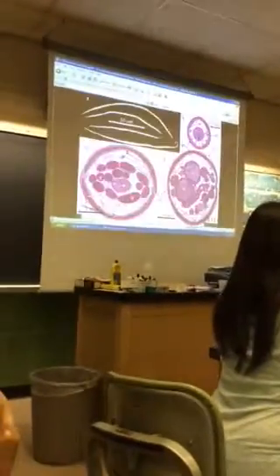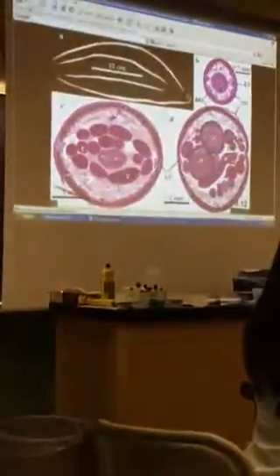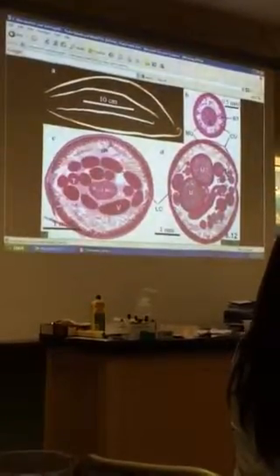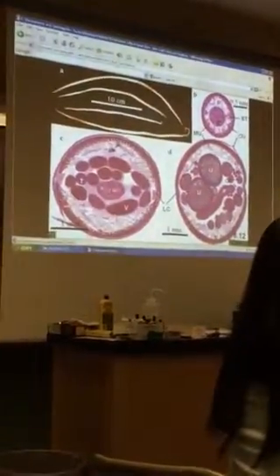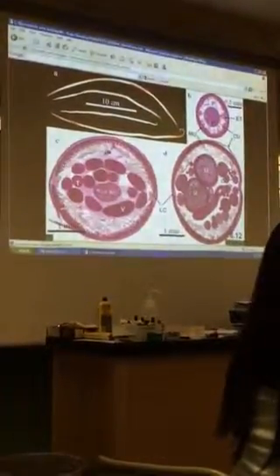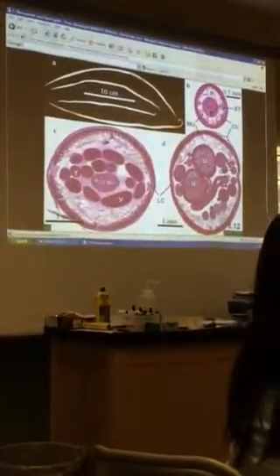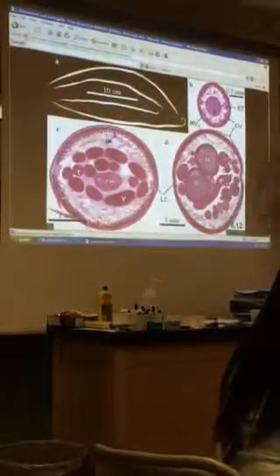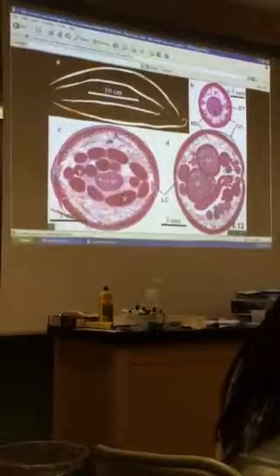Nice and big, and it just serves as a good example of general nematode biology. Not that everything is constant, but there are a lot of characteristics of the nematodes that we'll be talking about in class that we can see nicely here. So it'll help if you do the dissection first, because all that spaghetti in there, if we cut it crosswise, looks like a lot of little pipes.